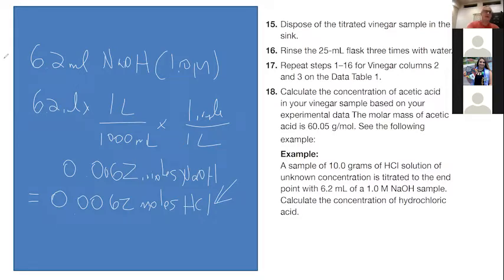Now, I multiply that by, I want moles over liters for concentration, right? And I have 10 mils and I want liters.